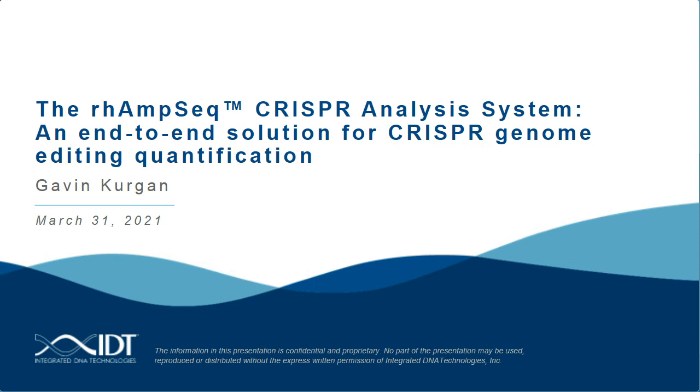As she said, my name is Gavin Kurgan, and I'm a bioinformatics scientist here at IDT. Today, I'm going to walk you through some work we've been doing to try and streamline genome editing workflows by providing an end-to-end solution for CRISPR genome editing analysis. This is something that we've called the rhAmpSeq CRISPR Analysis System.